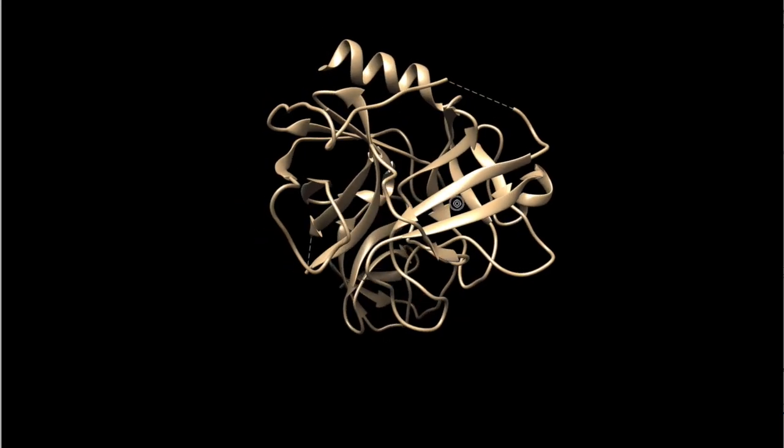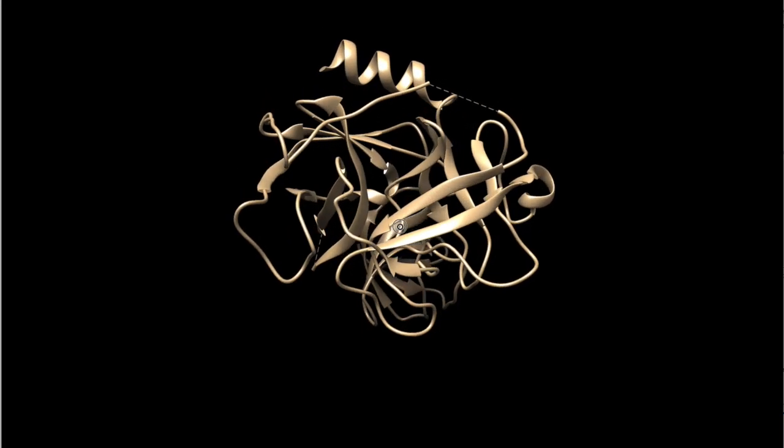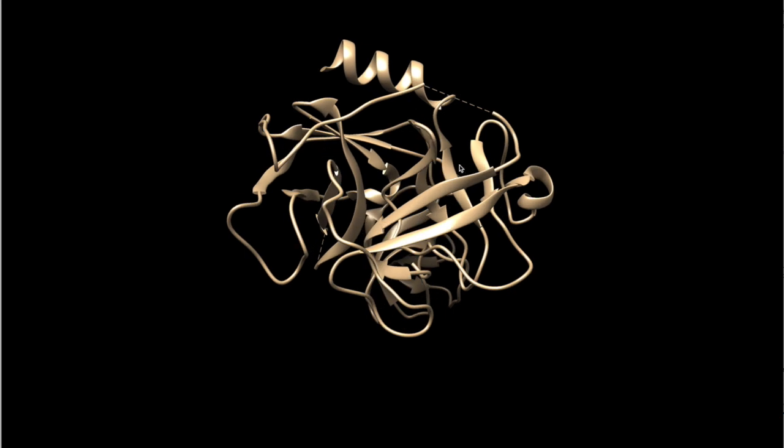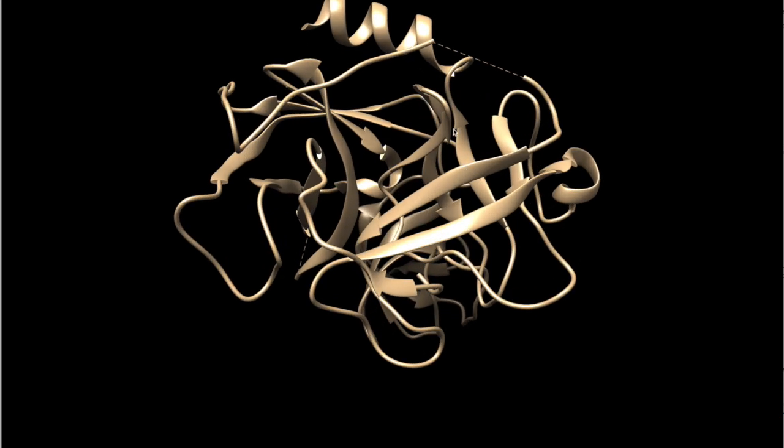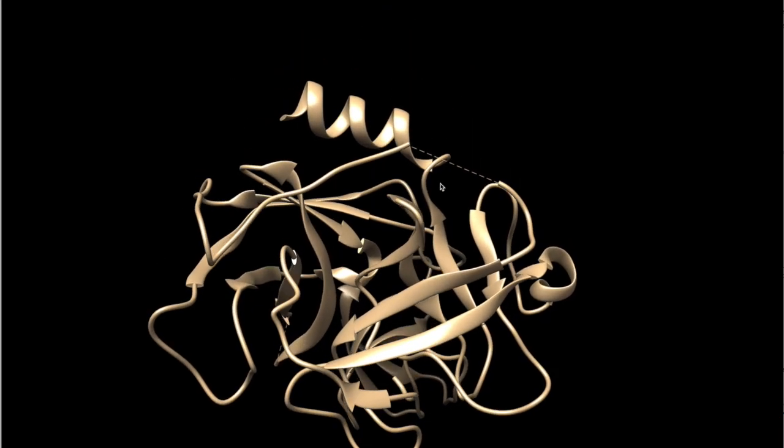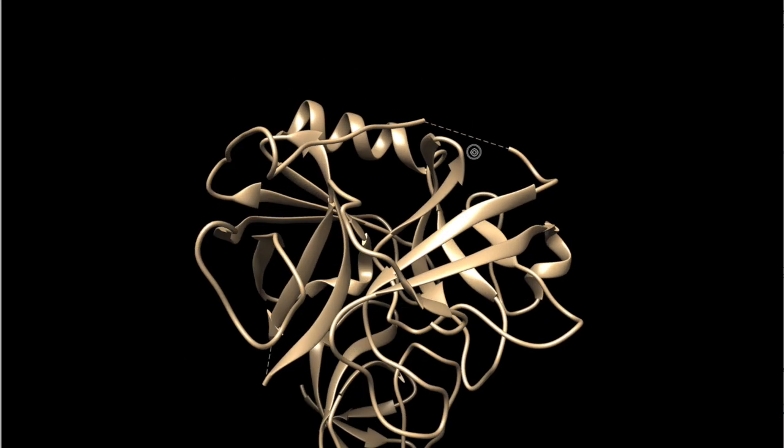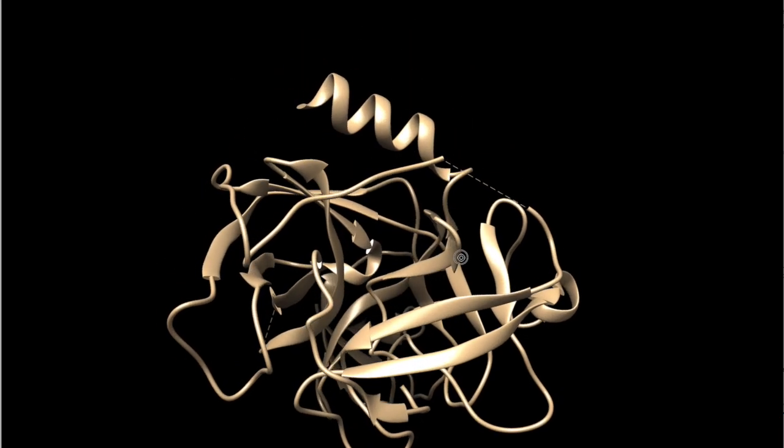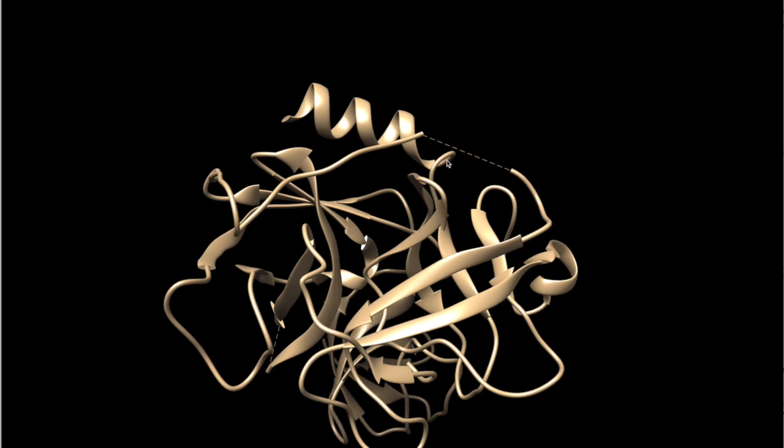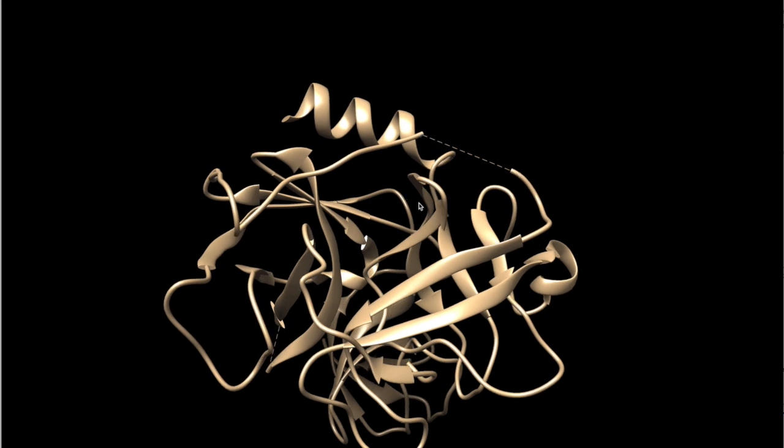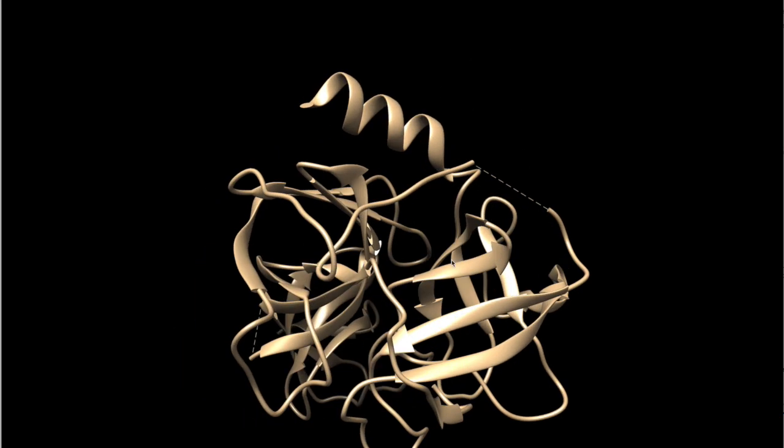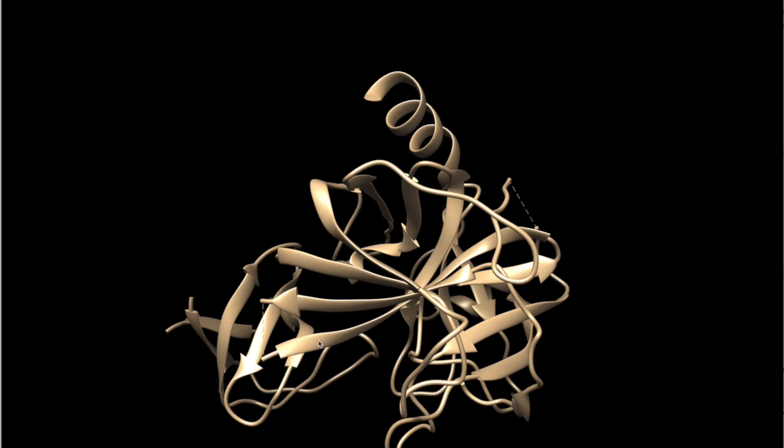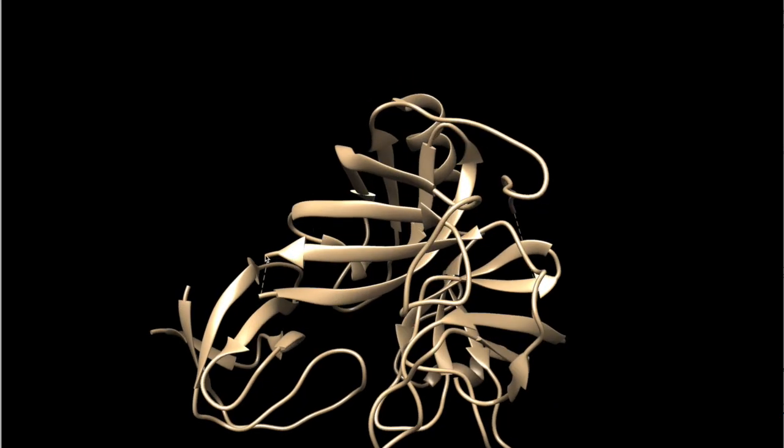Sometimes you see PDB models which have this dashed line. So what it means is that the actual structure is not known of this model, like here and here.